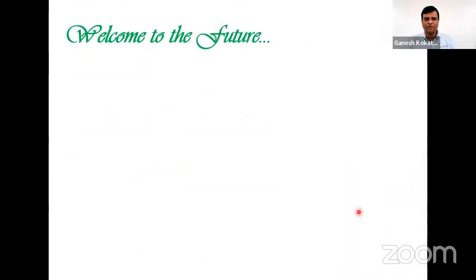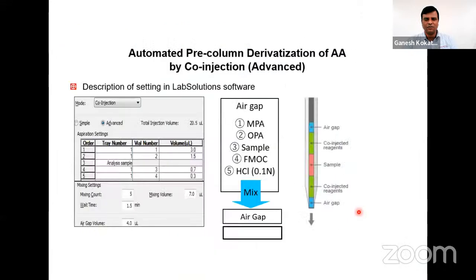And if we see about the future, normally amino acid analysis, since the last 3 to 4 years, has changed direction. For amino acids, we need to do pre-column derivatization or post-column derivatization for identification. As all amino acids are normally non-UV active, we need to identify them after derivatization on a fluorescence detector. So everything happens on the needle itself.